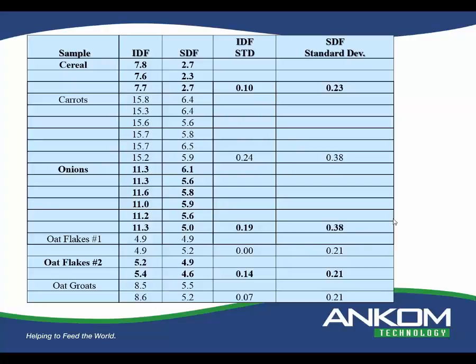But as you can see, even with the ones that we ran 5 or 3, or even more, I think there's one that's 6, 6 for the onions, you can see the standard deviations we were having are well below a 0.4. I would be hard pressed to see a conventional lab produce the kind of standard deviation to the precision that we are producing, both inter and intra lab. So that's just kind of a big overview.